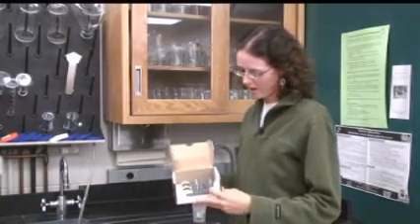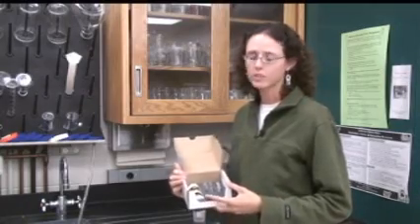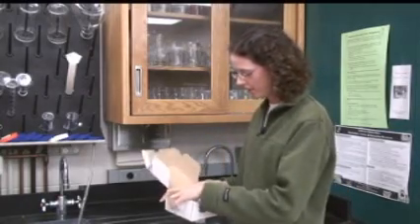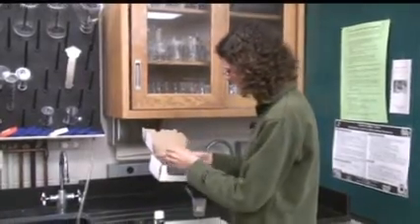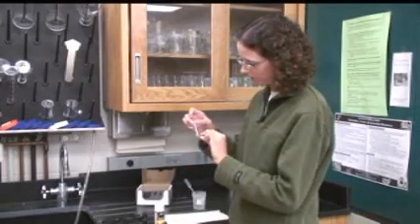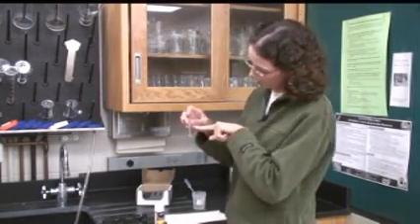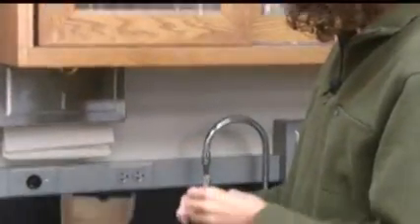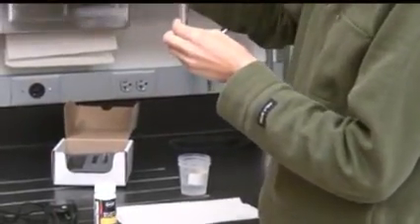The ammonia kit comes in a box with a bottle of test strips and three plastic vials. In order to run this test, take out your bottle and one of the vials. You will fill the vial to the third or top line with your solution. This is easiest if you have a pipette, rather than trying to pour it into the vial.